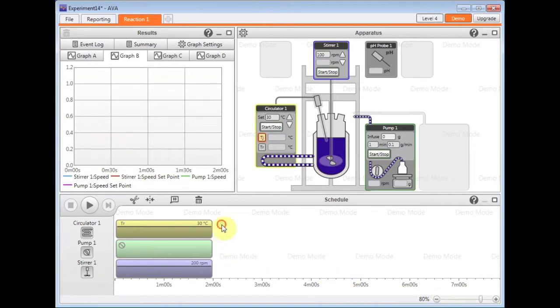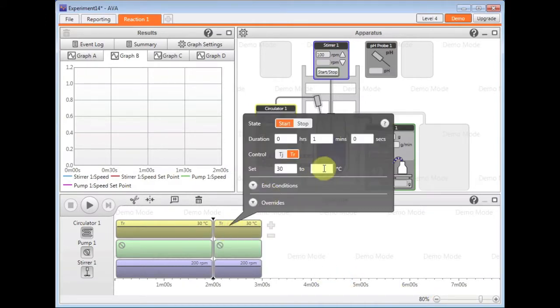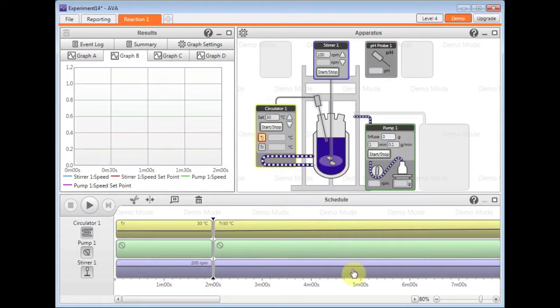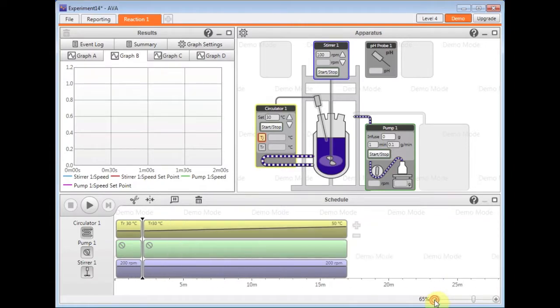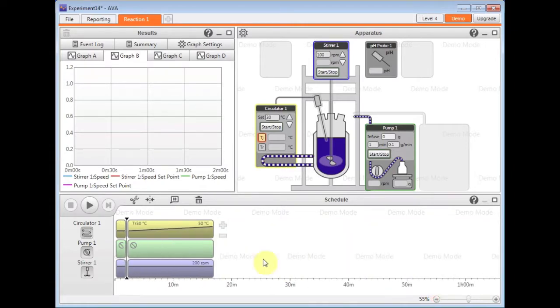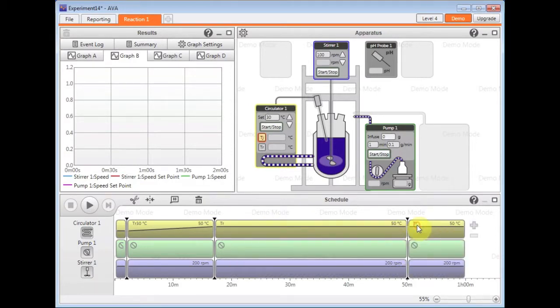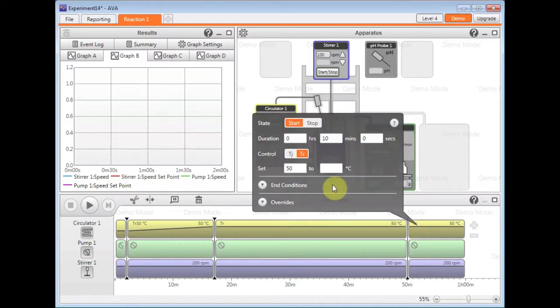And then I can add my next step. So perhaps heat to 50, hold at 50, and then add another step to cool down for example.